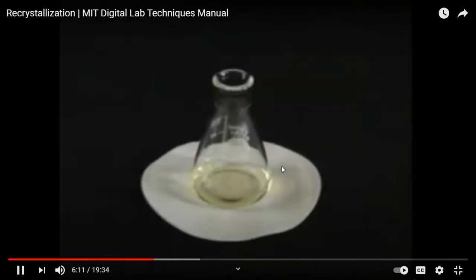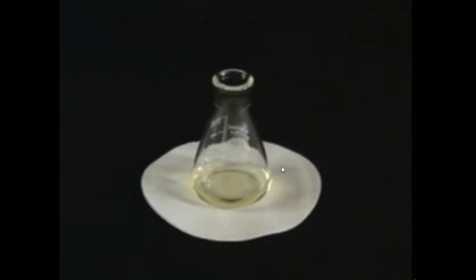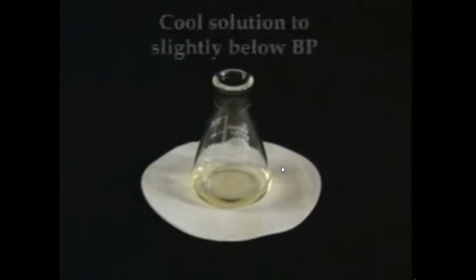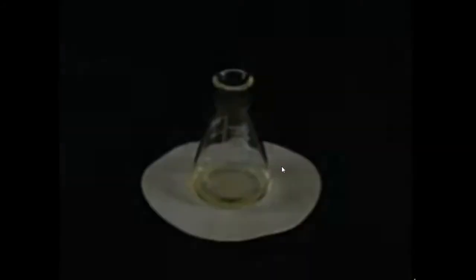Take a close look at the solution. Is it the right color? For example, if you're expecting white crystals and your solution is yellow, then there is a soluble impurity. One easy way to remove small amounts of colored impurities is with activated charcoal. Before adding any charcoal, cool your solution to slightly below the boiling point. Caution. Adding charcoal to a boiling solution will cause it to boil over.